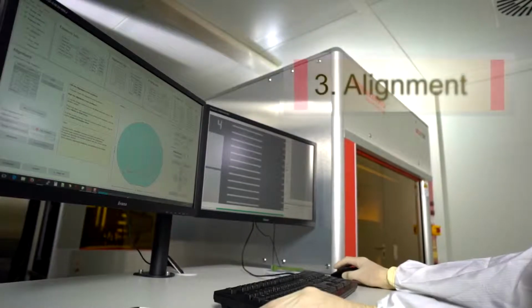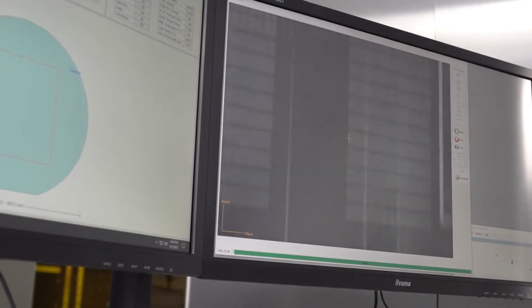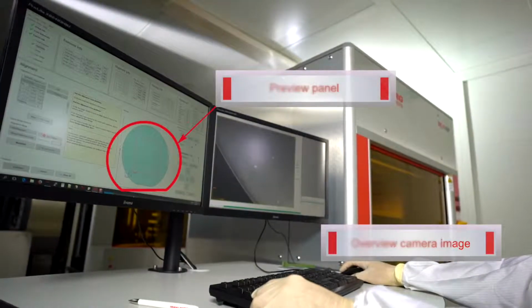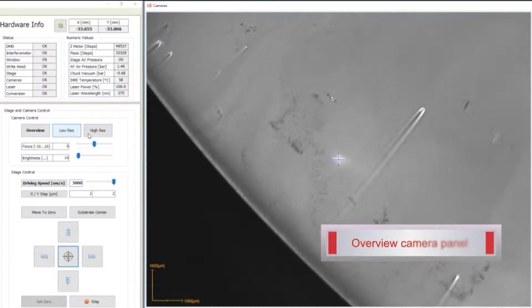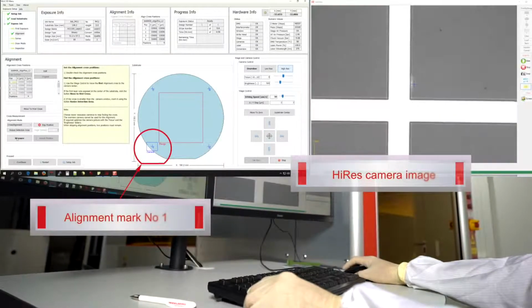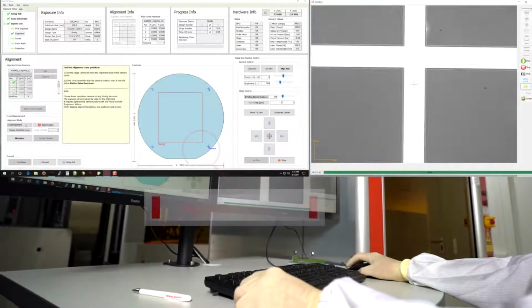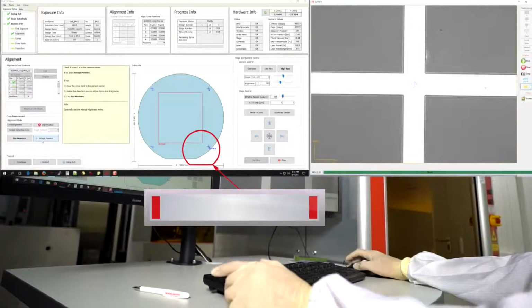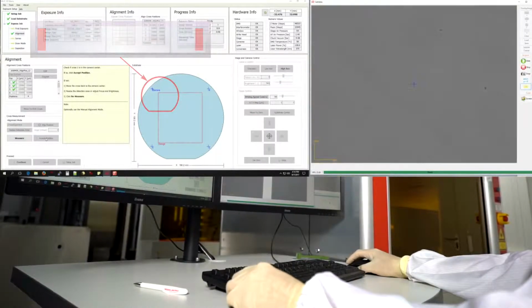Now we're ready for step 3, to align our pattern with the help of the alignment marks on the wafer. The first alignment mark is located easily with the help of the overview camera. Camera navigation is straightforward, dragging and dropping the camera window inside the preview panel. For precise location of the marks, we switch to the high-resolution camera. Once the first mark has been located, we can move to the next position. For each alignment mark, you adjust the position until you can see the mark in the camera window and click Accept. The system immediately moves on to the next mark.